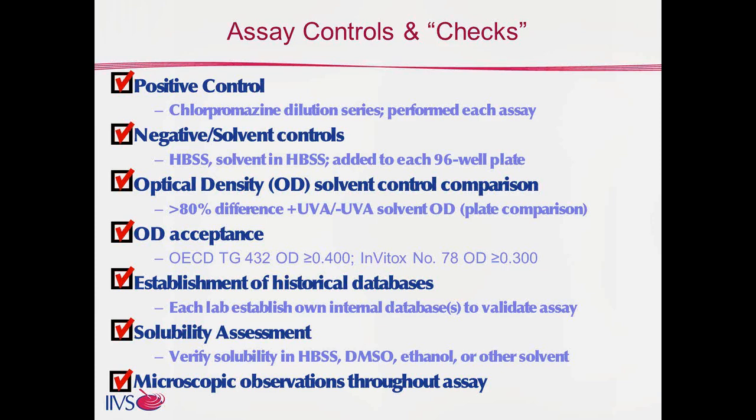The results of the controls and acceptance criteria should be continually monitored through a database. And it's crucial that each laboratory conducting the assay creates their own internal database to evaluate their assay responses over time. They will be important to evaluate assay acceptability and your performance.